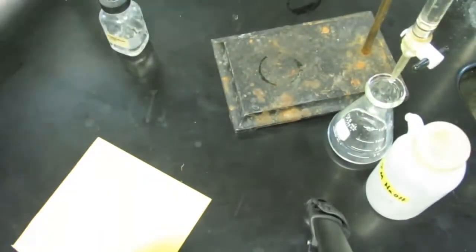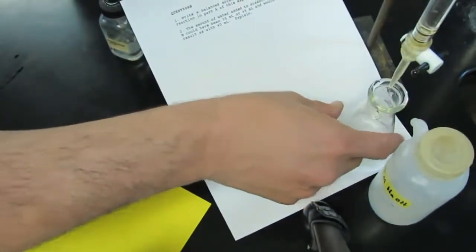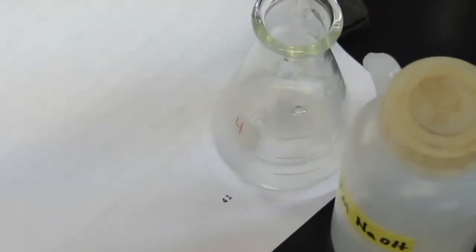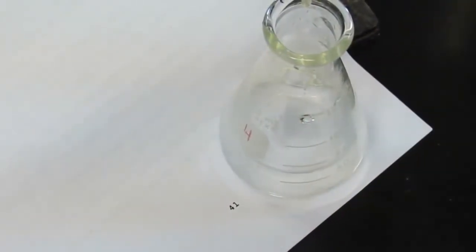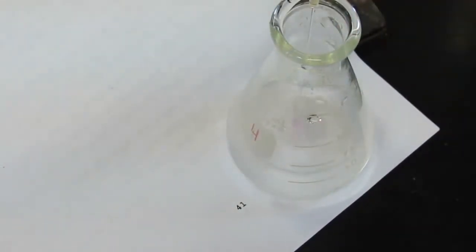Let me get a piece of white paper for you. Put that underneath here so we can see the color change. Let me zoom in on this as we do the titration. Hopefully you can see that. And we'll start adding our base. We've already taken an initial reading of both.